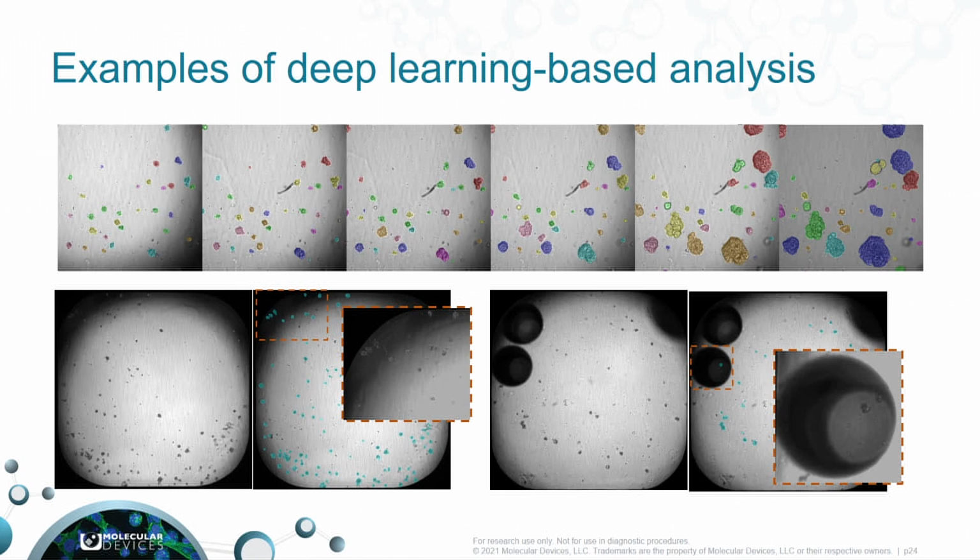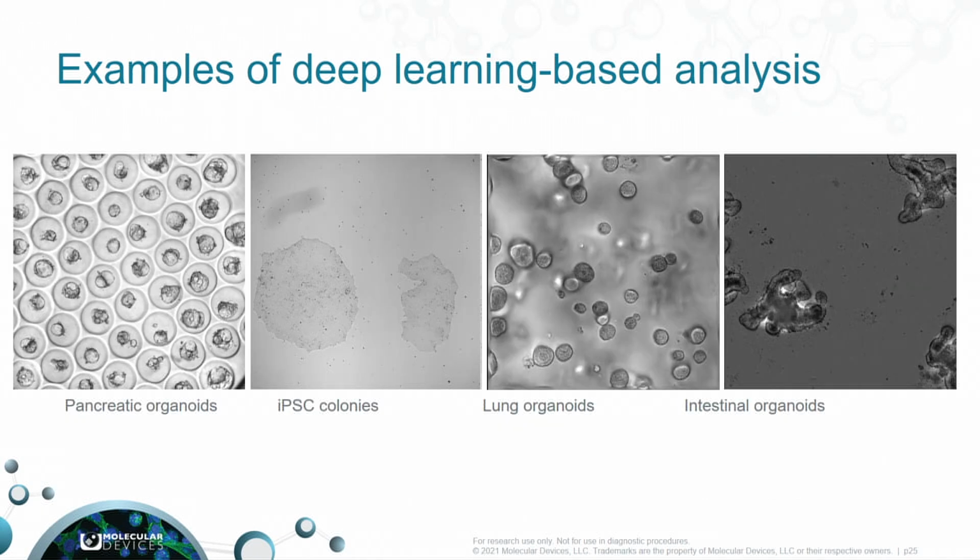So typically, when you're creating these Matrigel layers, bubbles are terrible. But over here, I was actually pleasantly surprised that it was able to still identify my object, and I can get readings or features from it. So for the example on your left, that's human pancreatic organoids that were grown in these microcavity hydrogel-filled plates from Sun Biosciences. And I like this because we could actually apply this to getting different results from it.